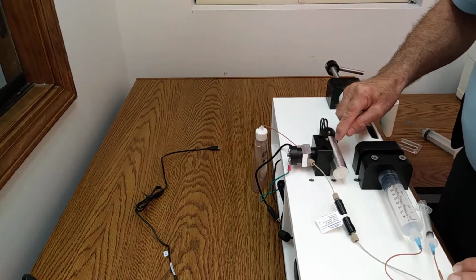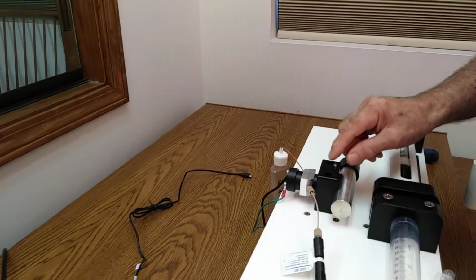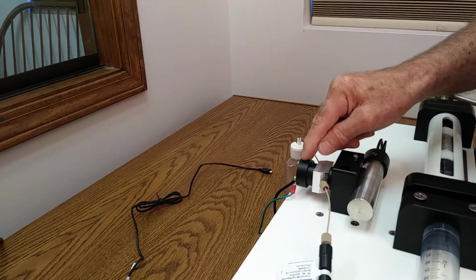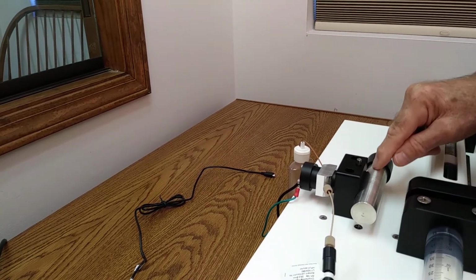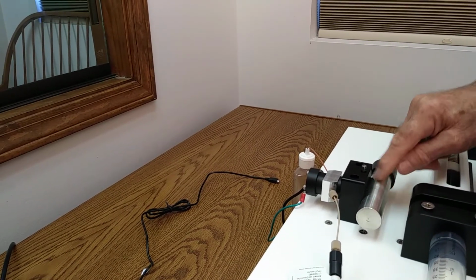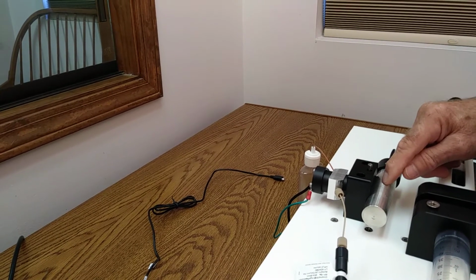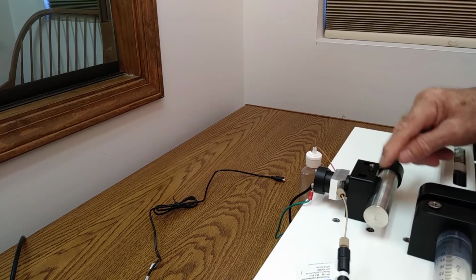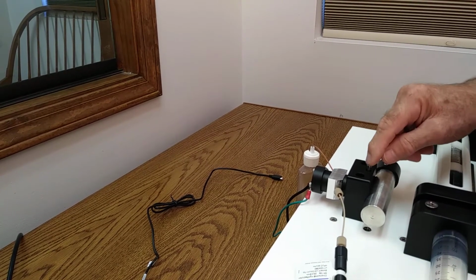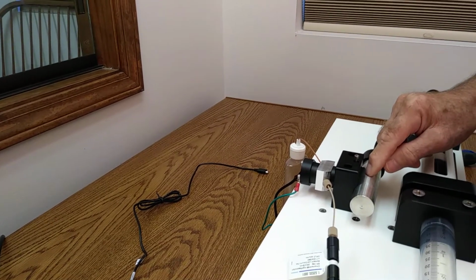The next thing in the system is the detector. The detector sees what's coming out of the column and displays it for us. The components of the detector are a lamp which is located inside of here. For the cannabis analysis, we use a 214 nanometer zinc lamp. There's a little screw here which we may use from time to time to adjust the light level. I'll explain that later. So we have light being generated here.